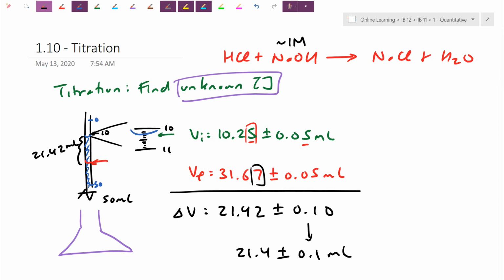Or it could either be, well, I completely don't know the molarity. I have this bottle. Maybe it's really, really strong, right? I really need to be safe around it. Or maybe it's already been diluted with water. Titration, the technique, is to use to find this unknown concentration. What we're going to do here, we're going to see towards the end of our virtual lab, I'm going to be titrating. I'm going to put base in the burette. That's not a given, but I'm going to prefer to have the base in the burette, and therefore I can drop this base here into the acid.